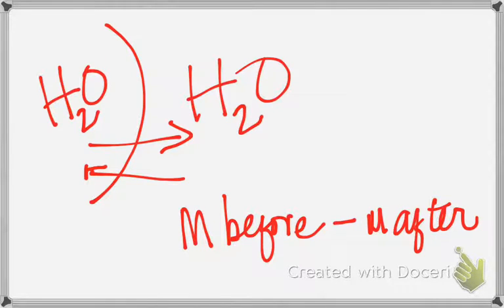What's in eggs? Protein. So we can't use iodine to tell if there's protein moving. We'd use what? Biuret. So on Monday, I want us to test our solution and see if we can detect any protein outside of that egg. That'll be fun, huh? Okay. What else can we test for?